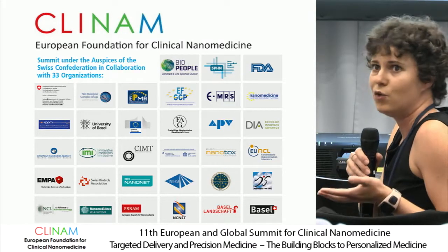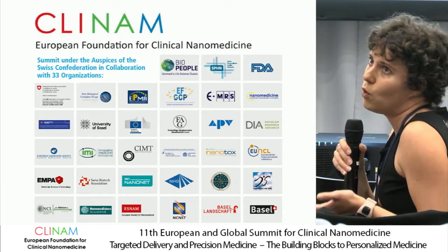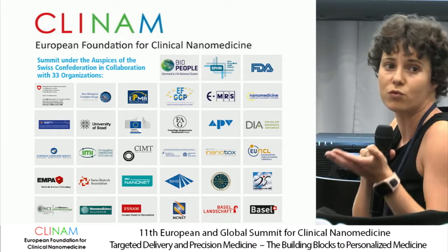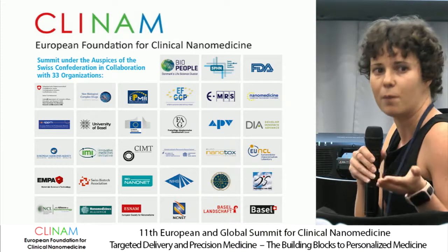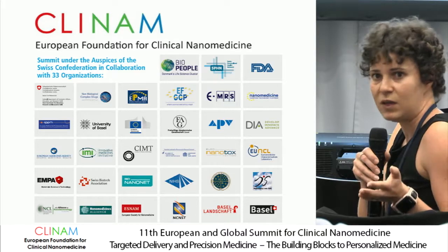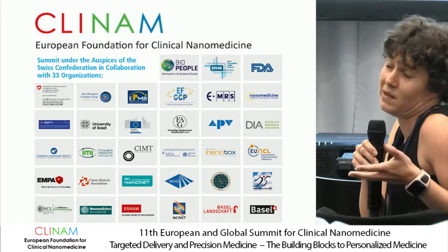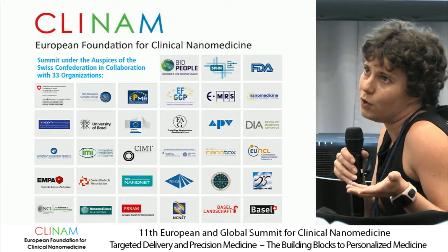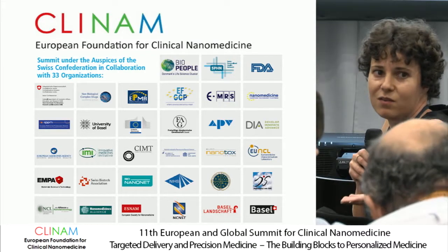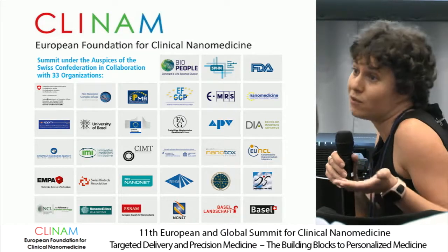But of course, you have to start somewhere. So, for example, if you want to know if your technique has the resolution that you need, we always suggest to start by testing a mixture of polystyrene standards that may be similar to the particle size distribution you are expecting in your system, and at least test if your system is capable of resolving that. But having said that, that doesn't mean it is the perfect standard for you. It may not exist.